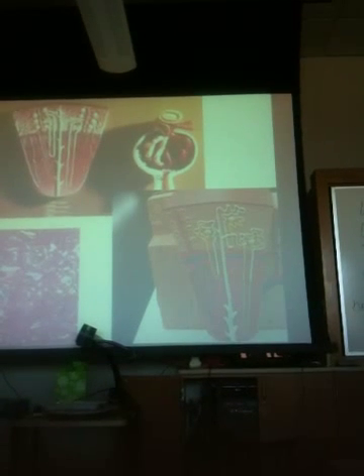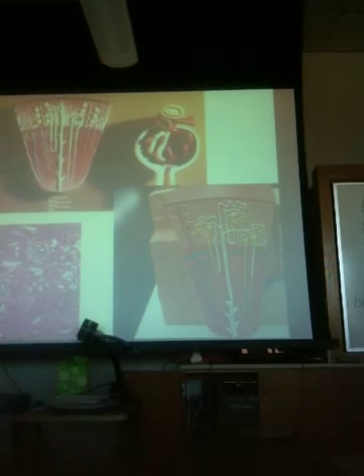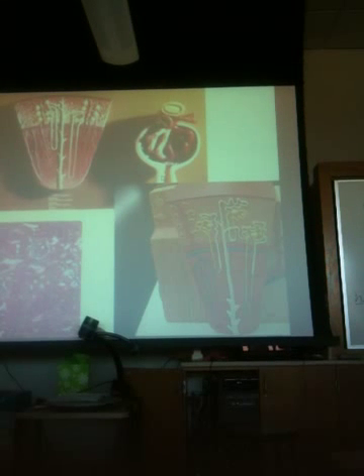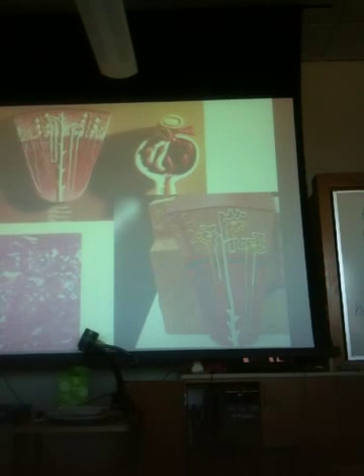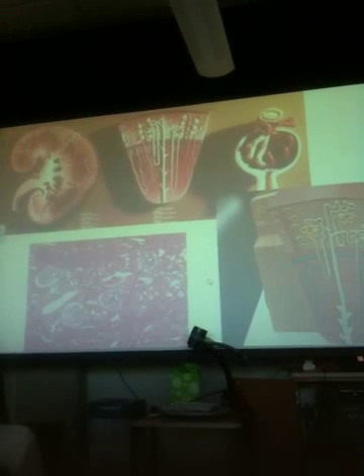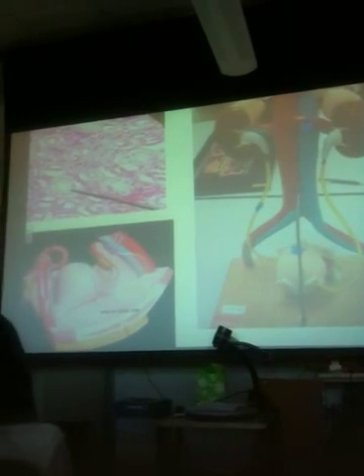What's the specific kind of tissue making up the wall of that PCT there? Simple cuboidal. Okay, view of tubules. Right here at the pointer, there's a good view of simple cuboidal right there.